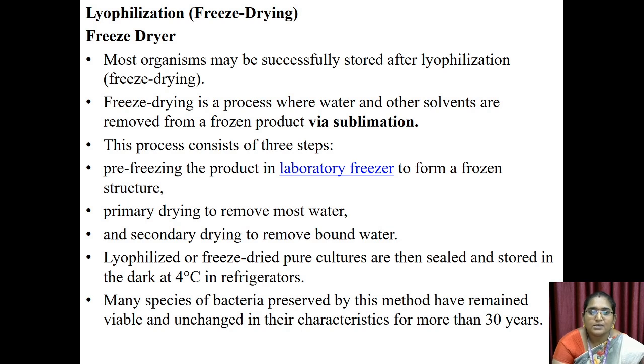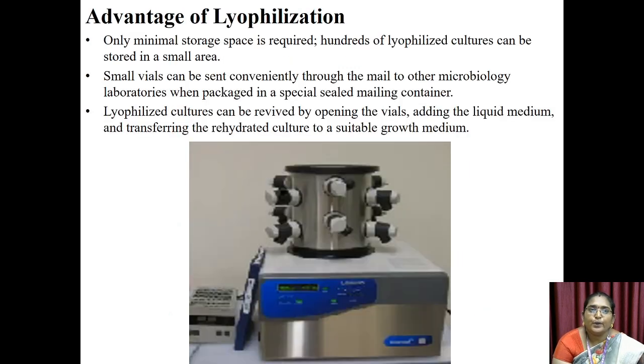Lyophilized or freeze-dried pure cultures are then sealed and stored in the dark at 4 degrees Celsius in refrigerators. Many species of bacteria preserved by this method have remained viable and unchanged in their characteristics for more than 30 years. Advantage of lyophilization. Only minimal storage space is required. Hundreds of lyophilized cultures can be stored in a small area.